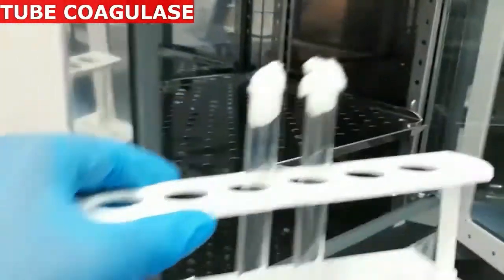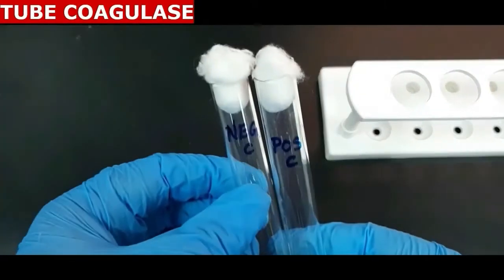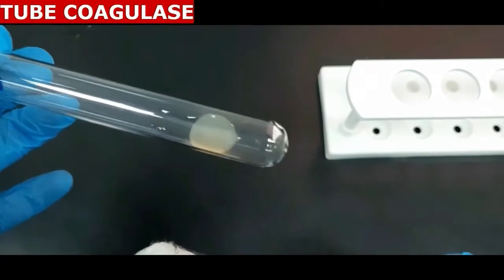After incubation, look for the formation of clot. The tube should be gently tilted to look for the clot formation or the agglutination. Make sure the tube is not shaken because it may disrupt the clot formation.